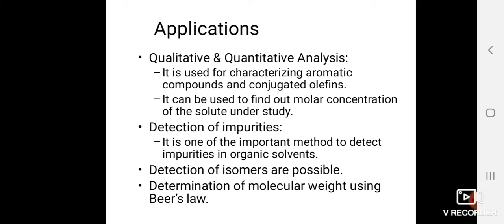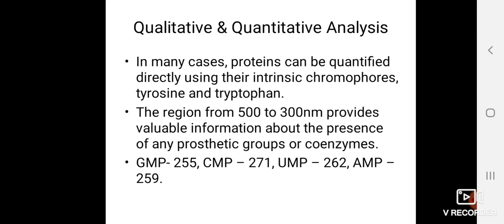Then detection of isomers is also possible with this, because isomers have different wavelengths of absorption and can be easily detected. Determination of molecular weight is also done using Beer's law. So you can see some of the absorption maxima.